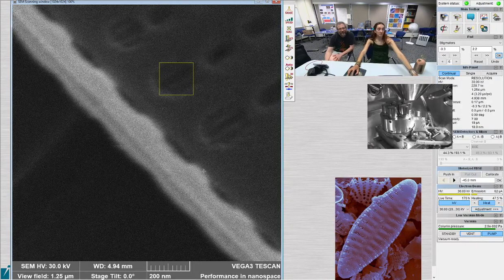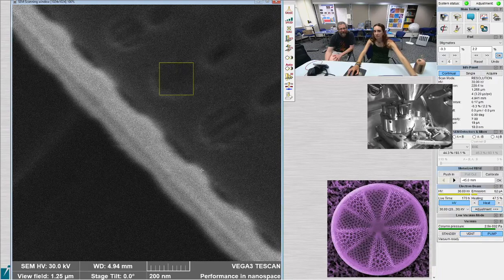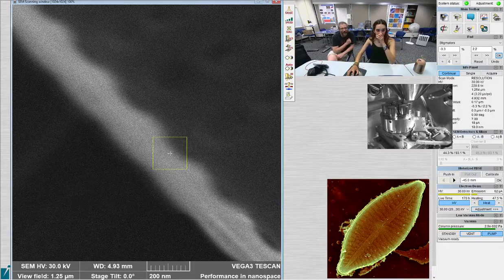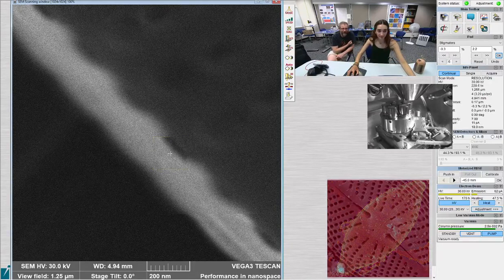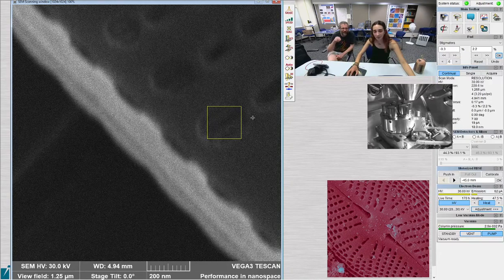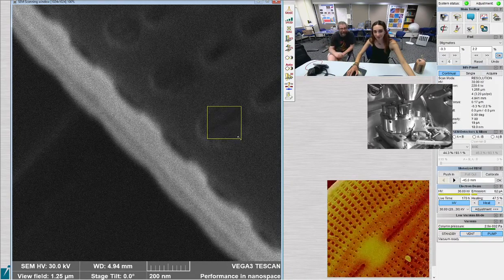I'm really not seeing anything. I think you took it out of focus. Double click the box and just get rid of the box. Now just focus on that. Or make the box bigger, one or the other. How do I? Click with the right button and pull. Ah, there you go.